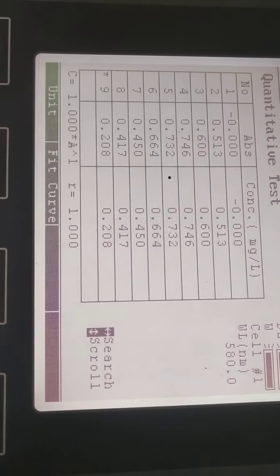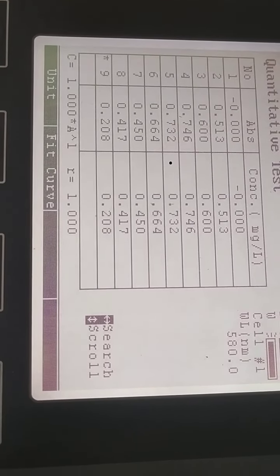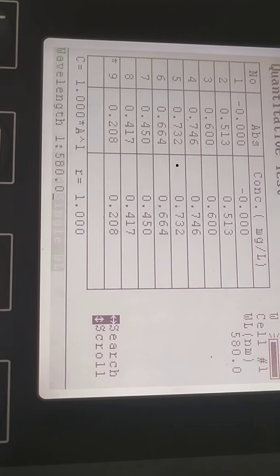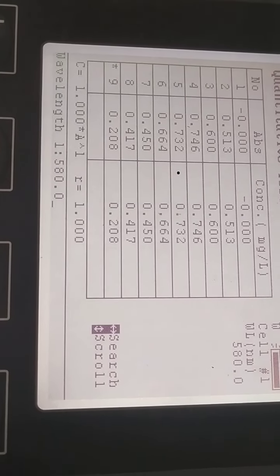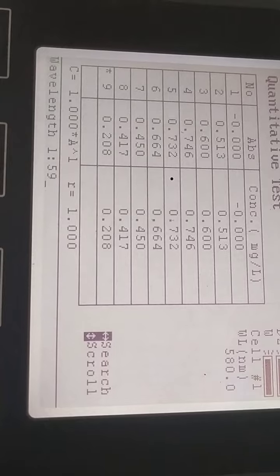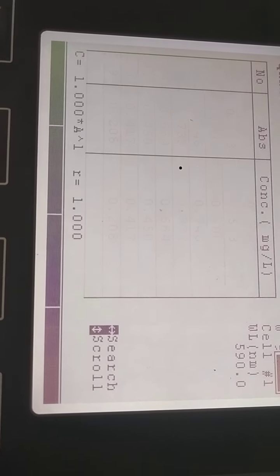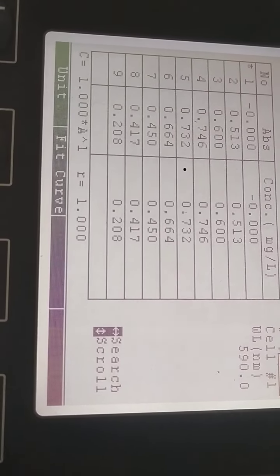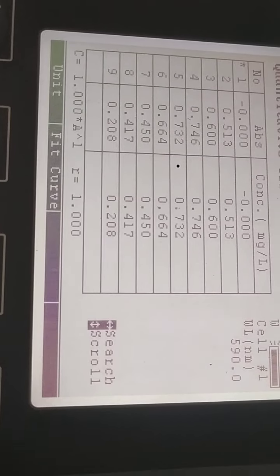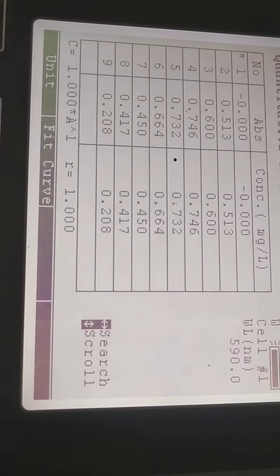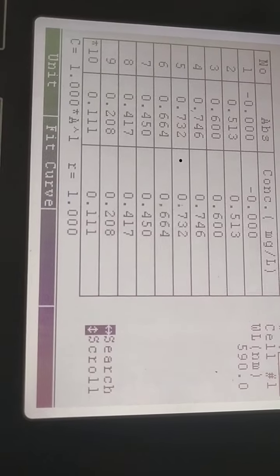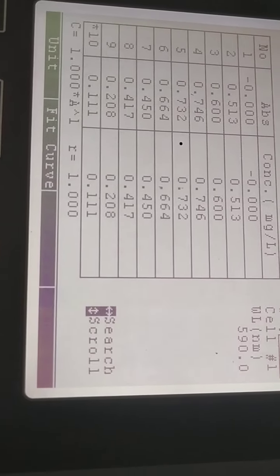Now further we want to change our wavelength to 590. Okay, this is huge.